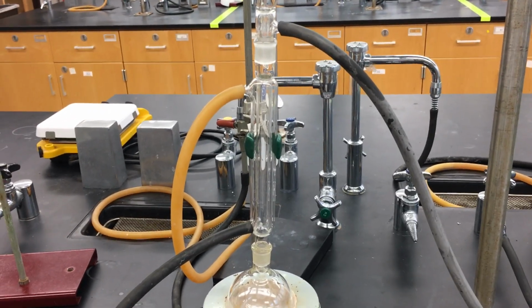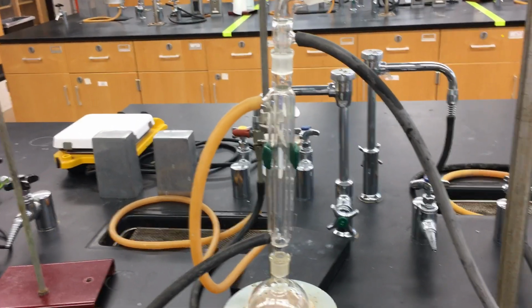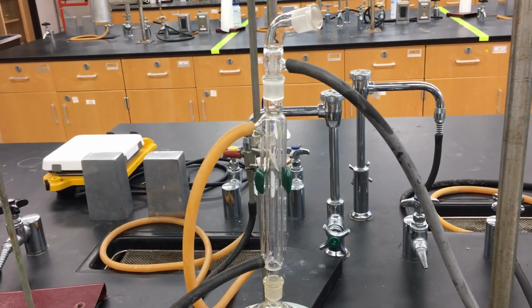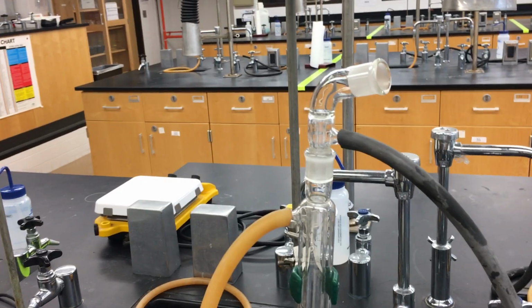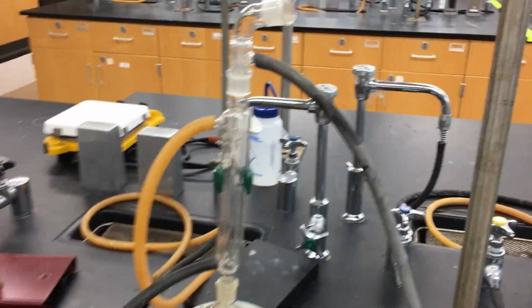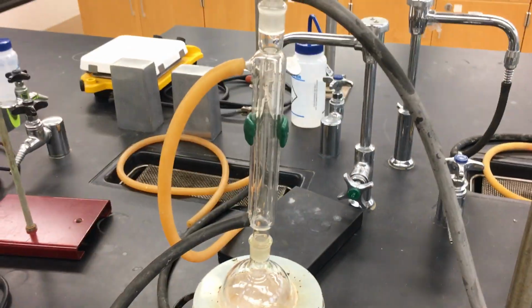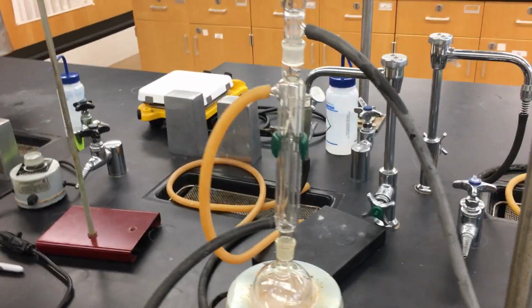What is refluxing? If you know anything about a condition called acid reflux disease, where the acid rises up the esophagus and then comes down again to enter into the stomach, it is a condition that many suffer from. Biologically, that's not something we want to suffer. However, in an organic lab, we are going to actually utilize that technique to accomplish certain reaction syntheses that otherwise would not happen very easily.